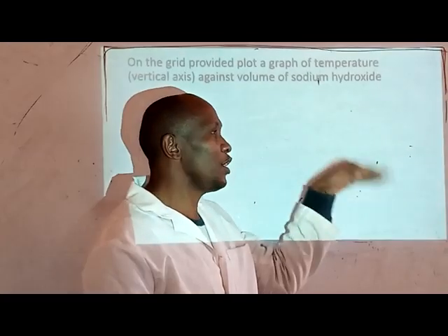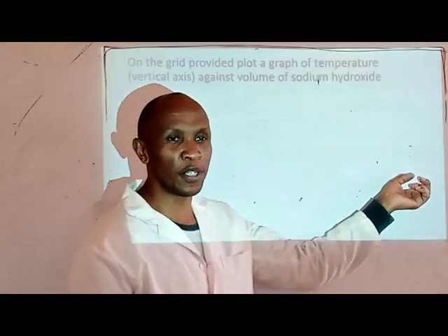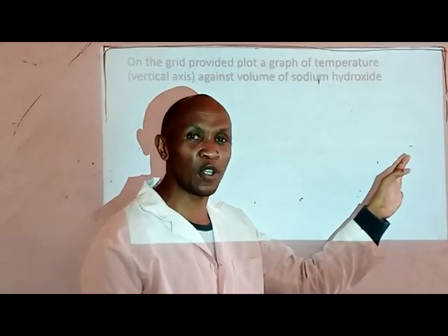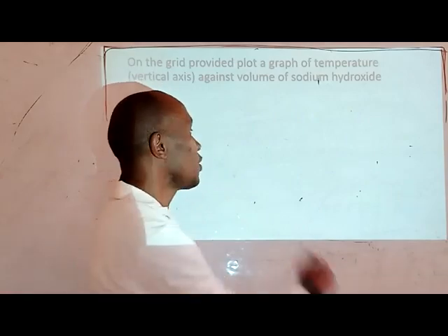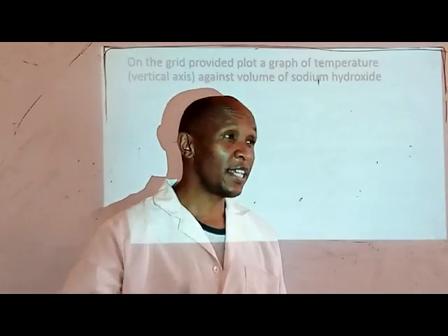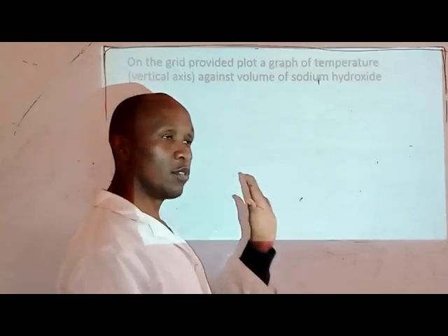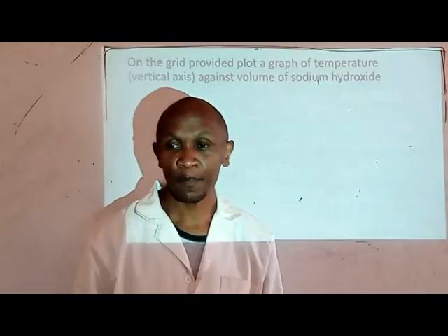Yet you are continuing, when the reaction is over, to add some cold sodium hydroxide to that. Whatever sodium hydroxide you add after the reaction is over will only cool the mixture. So the temperature should rise and then drop. If you don't get that, there is something wrong with your experiment. You need to redo the experiment if you can, or somehow ensure that is what happens. It should rise and then drop.